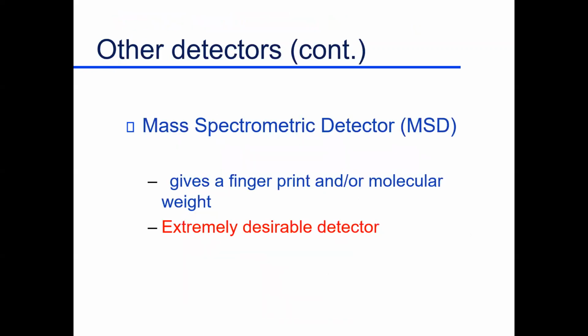We were to the point of talking about mass spectrometry or mass spectrometric detection. And that's been an exceedingly useful tool to us as a detector. If you go down in our lab, almost every GC we have is also connected with a mass spectrometer. That's just a marvelous detector, and I'll go through why that happens to be the case.